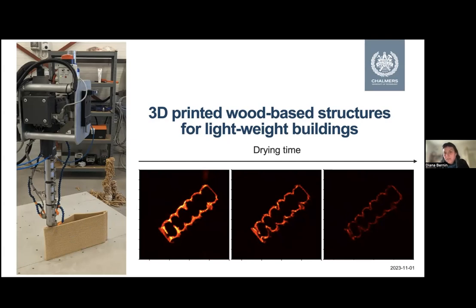And for this, MRI is again a very good technique. So we soak, now this time we did not have to build any MRI rig because we could only immerse one of these pieces, not this big one, but a part of it, into the water and then see how it behaves. So here it has been soaked, and it's quite obvious that we do not really see that the water is going to be where it's more dense. It's basically only swelling on the sides.